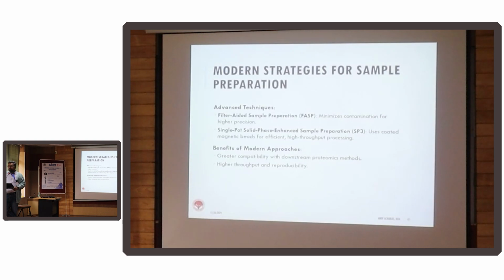So it gives you higher throughput, it gives you higher reproducibility, but of course what is not mentioned here is it also gives you a higher bill, something that you need to think of when you're designing your experiment.